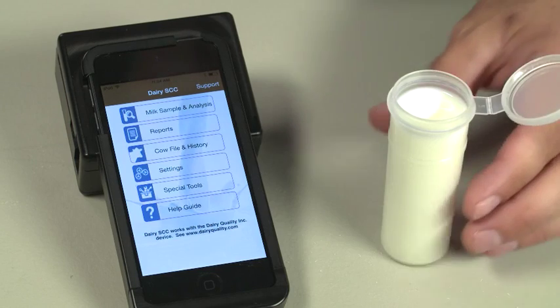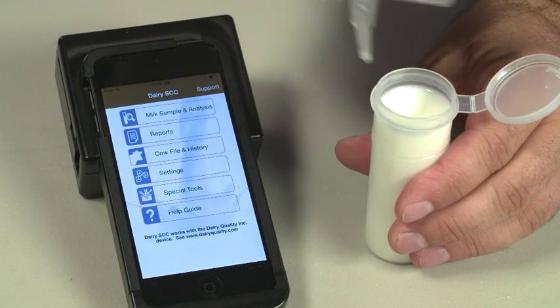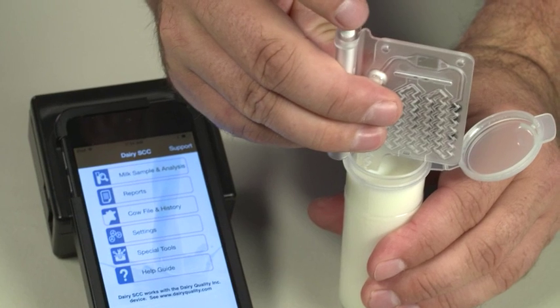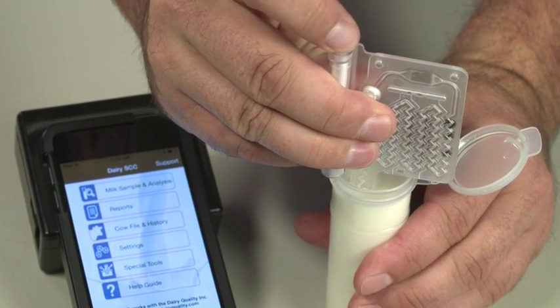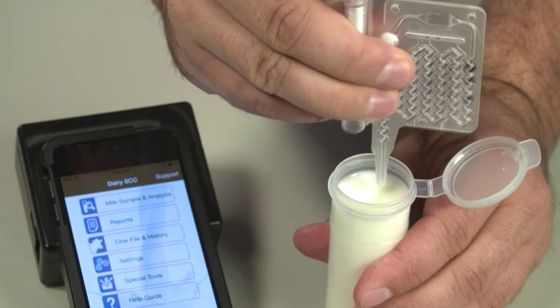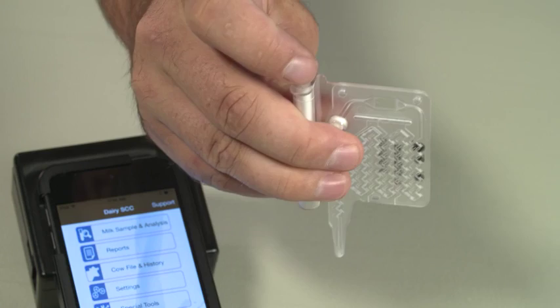Taking a milk sample: using a milk vial, insert the slide into the milk. To ensure you get the necessary amount of milk for an accurate test, please do the following. Make sure the slide tip is fully inserted into the center of the milk. You may have to tilt the vial to ensure the slide tip is fully immersed. Press the piston only when the slide is fully immersed in the milk. You will know you have the correct amount of milk when you see the milk pass through the middle of the third column of tracks or capillaries.